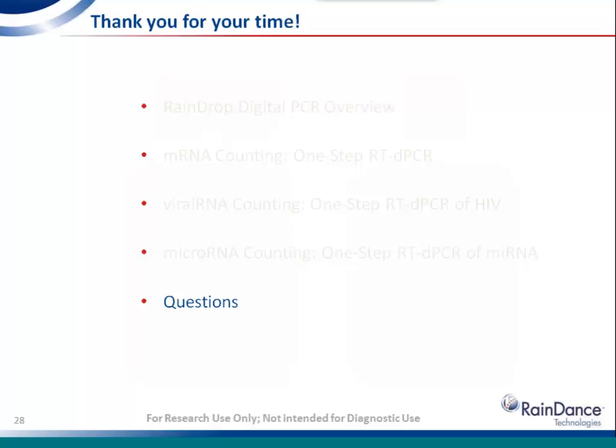We demonstrated up to 10-plex using this single molecule formatting where you can use 2 colors and several intensities for each. It's extremely easy to put together 4-plex assays or even 5-plex assays. To do additional multiplexing beyond that will require a little bit of optimization, but it's very straightforward.